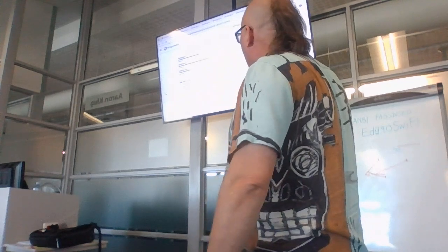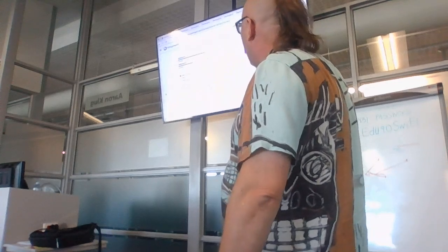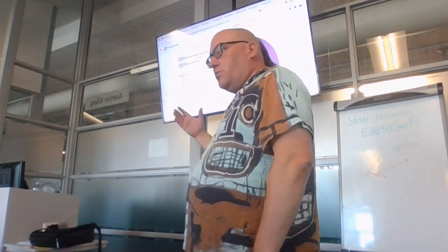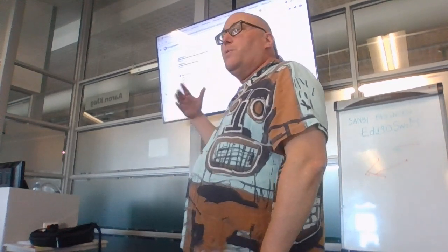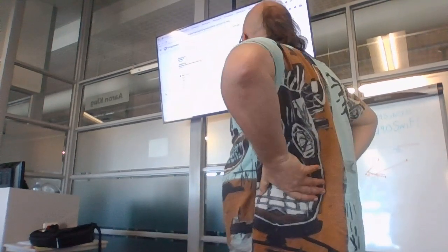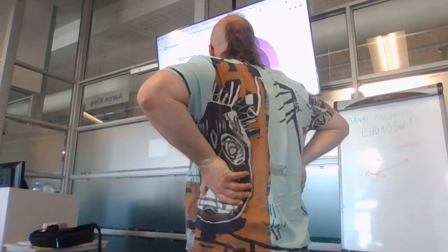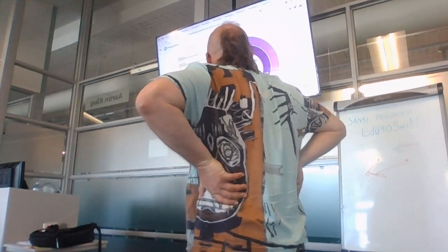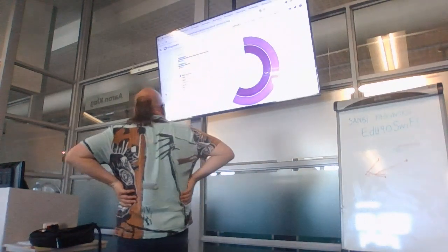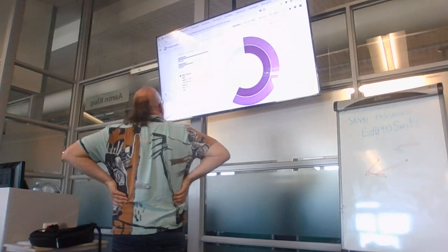And it's busy doing some more analysis, just waiting for everything to get there. Because Pathogen Watch has built tools for all sorts of different pathogens. Vibrio cholerae is one of them. And it can do a whole lot of standardized analyses, and it's telling you what it's busy running over here, but I'll wait for it to finish running before I look at the reports. Damn it, our network is really slow today.